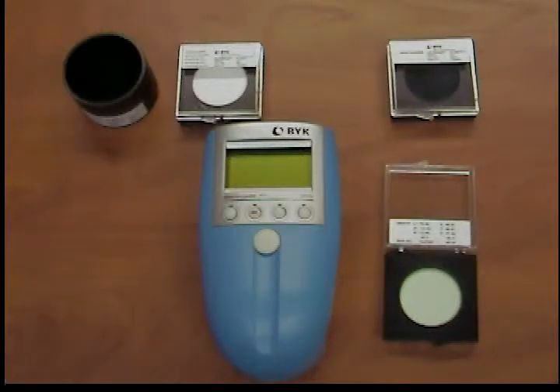The values for the test standard are stored in the measuring instrument. When you measure the green standard with the check green option from the calibration menu, you receive a message indicating whether recalibration is necessary. You should also carry out this test immediately after calibration in order to determine whether it is performed correctly.